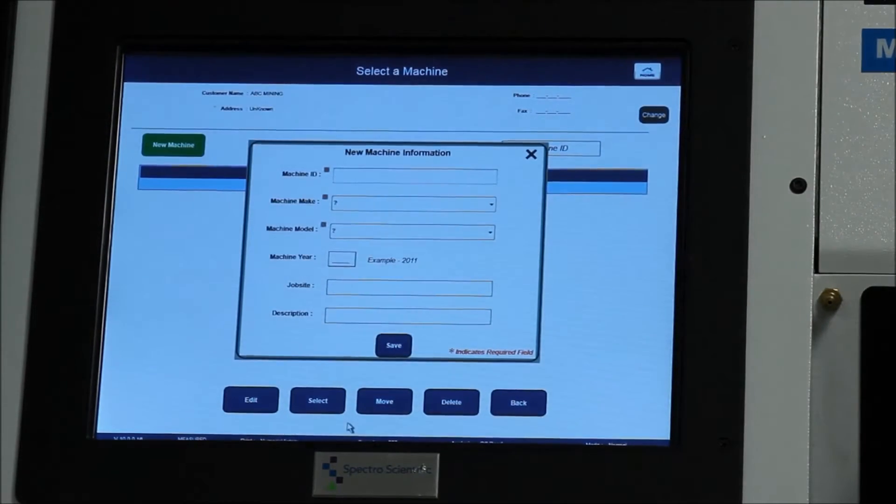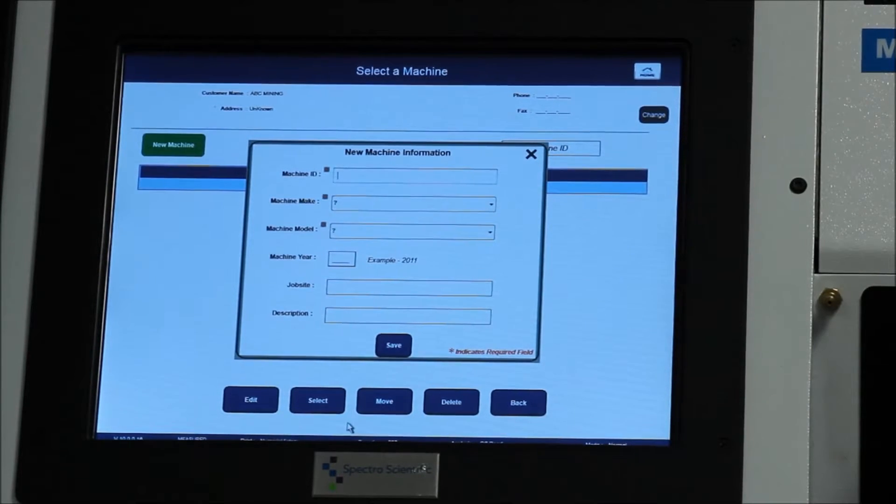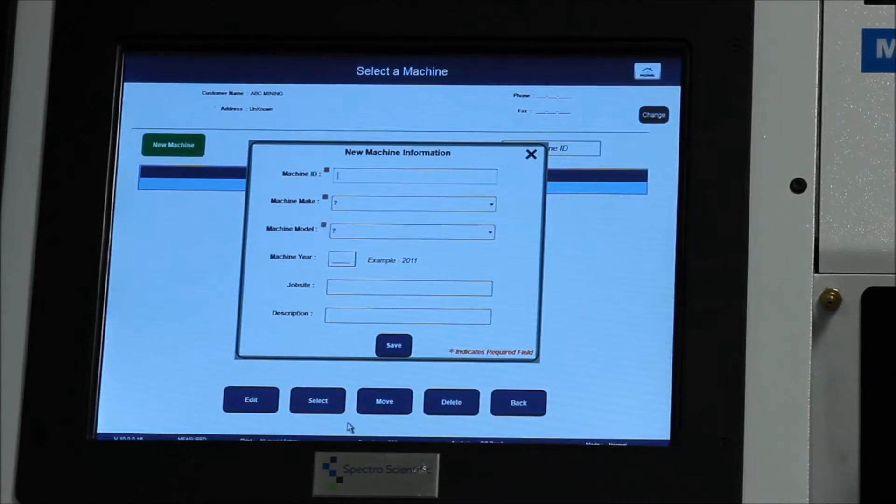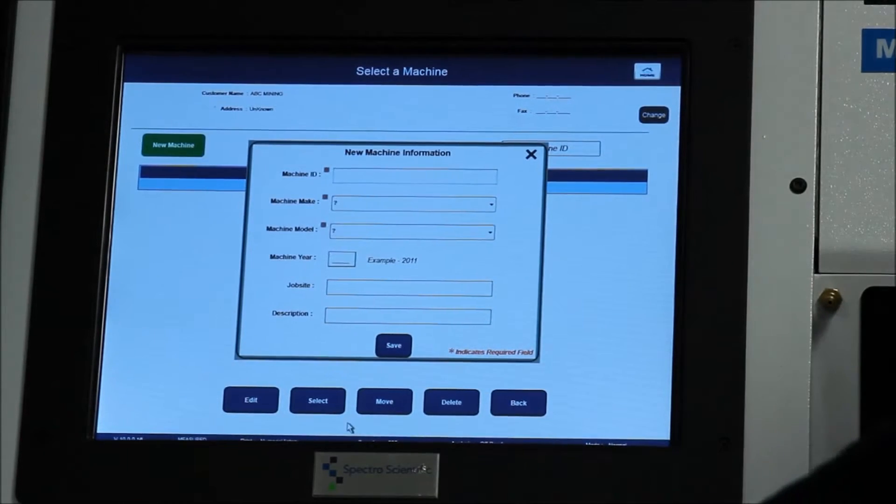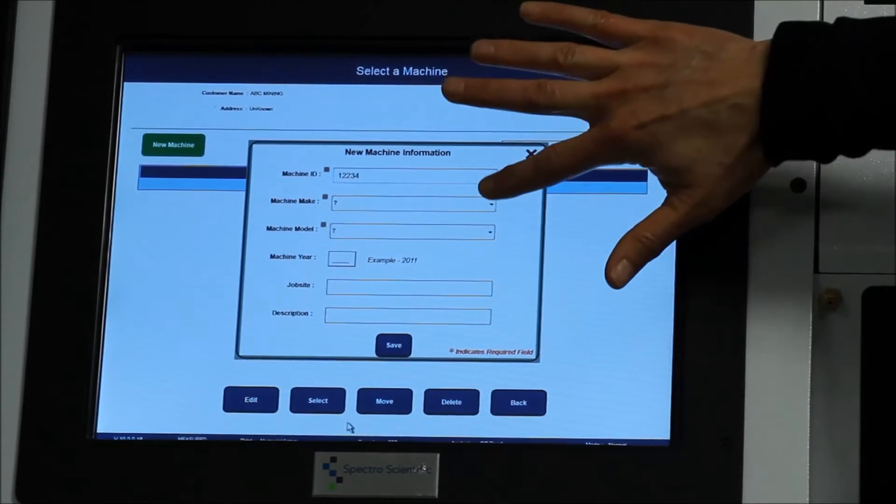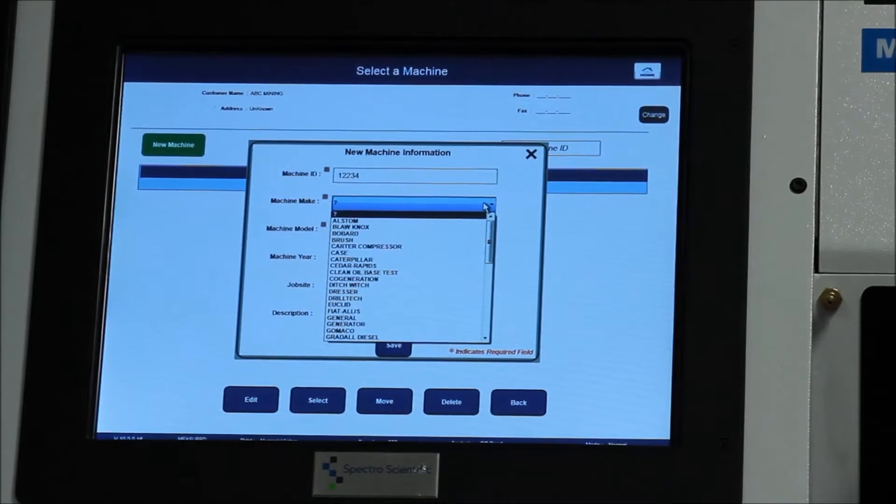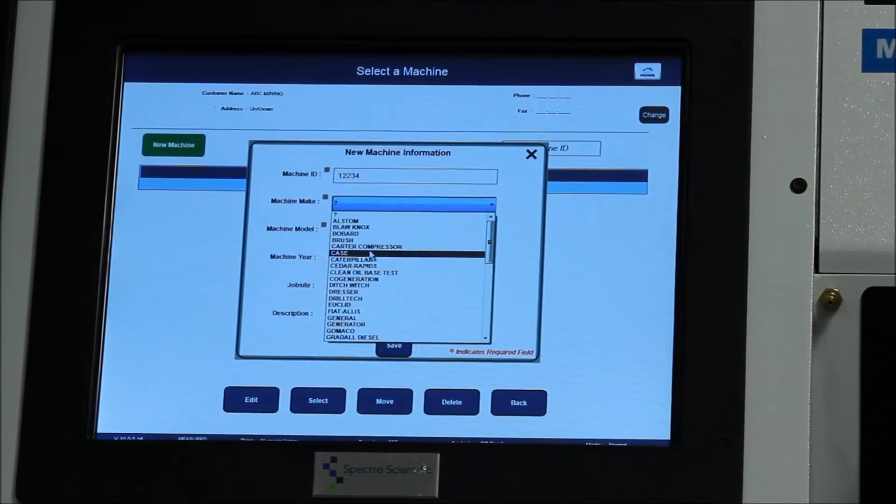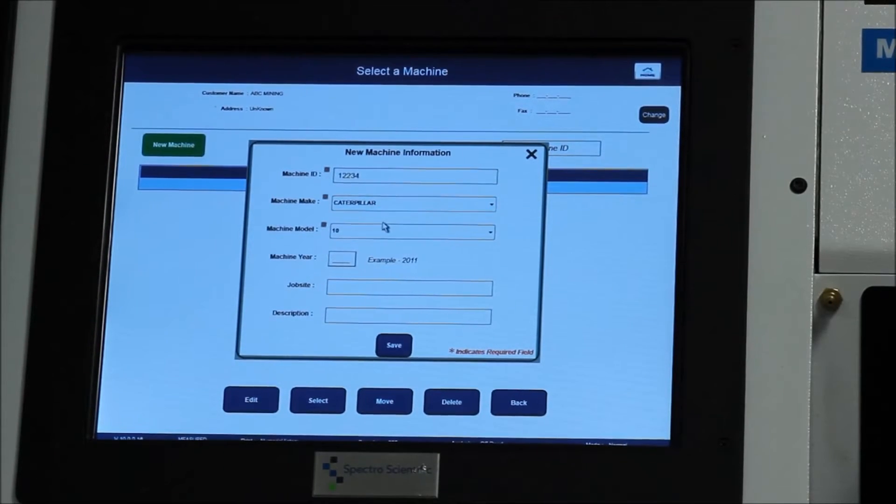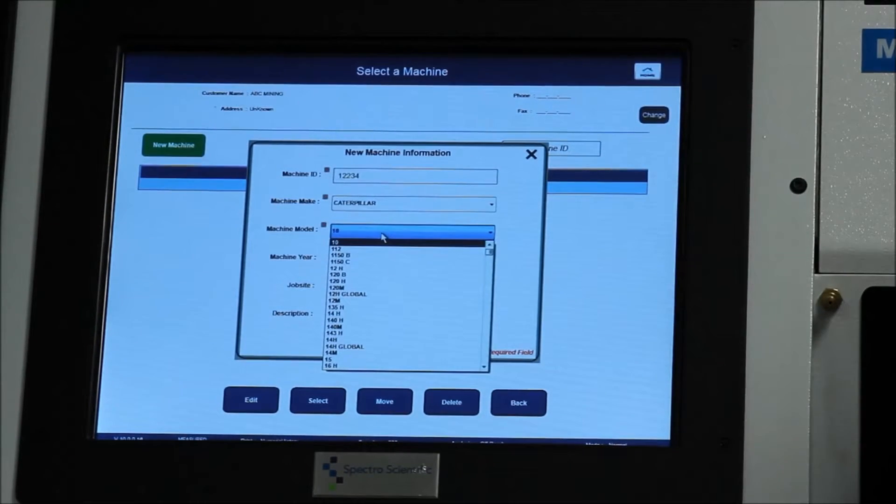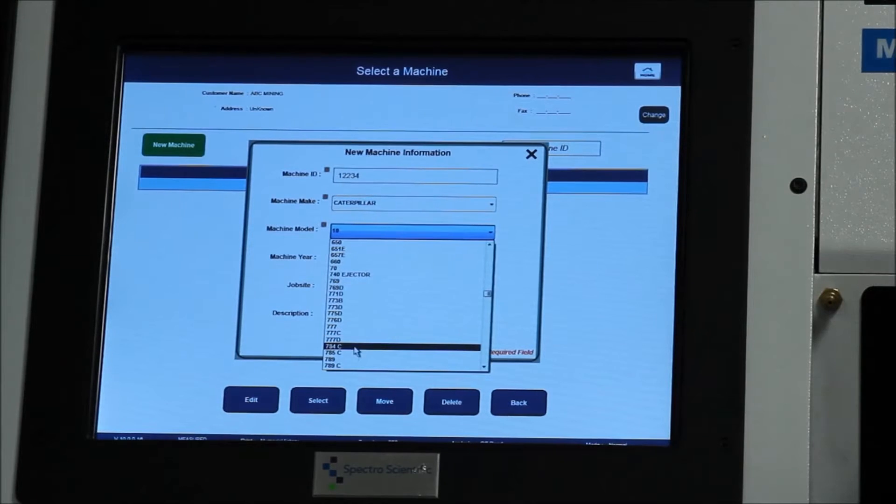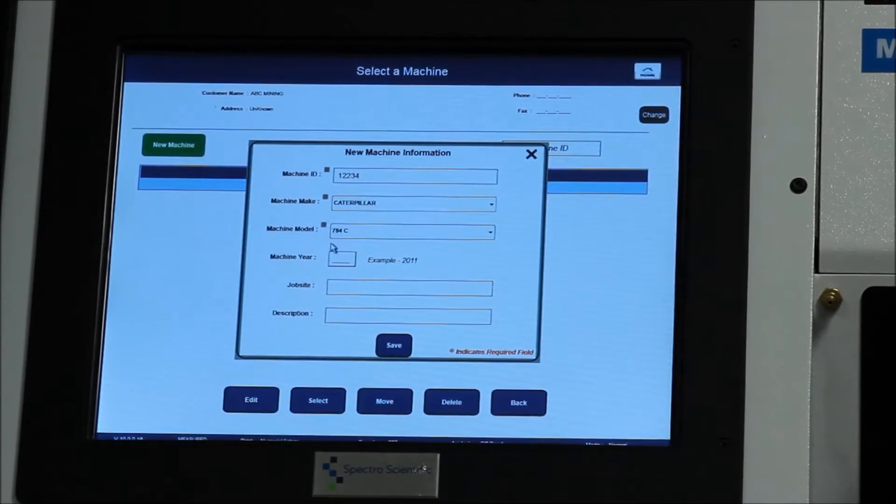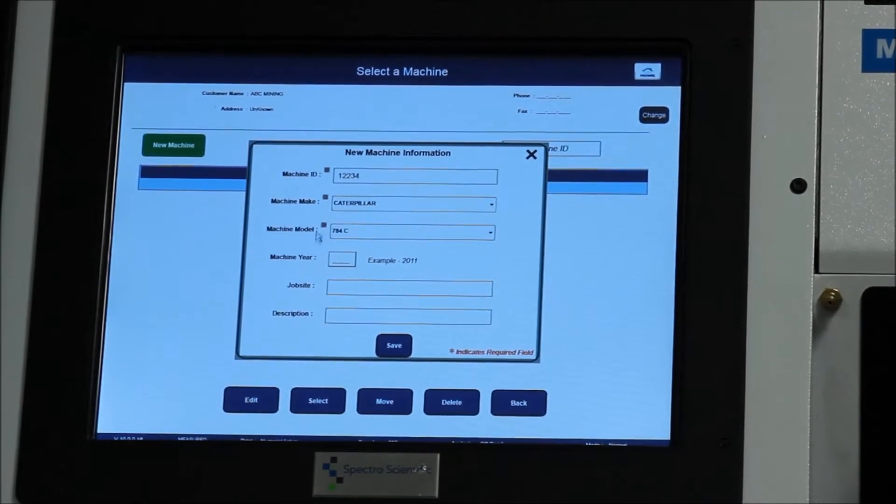Next it wants to know about the equipment that's being tested. So the machine ID is simply an identifier for that machine. It can be either a VIN number or a plate number or any other kind of fleet number that's used to identify that vehicle. Next it wants to know the machine make, so the vehicle. In this case, we're going to choose Caterpillar. And it wants to know a model for that Caterpillar. We will choose a 784. You can either start typing it in or you can scroll down until you find the equipment that you want. You can also fill in other information about that equipment, but the red asterisks highlight which information is required.